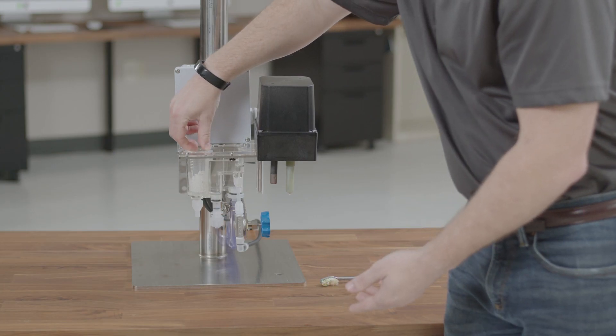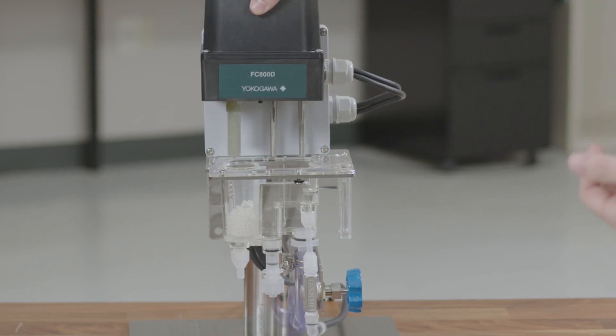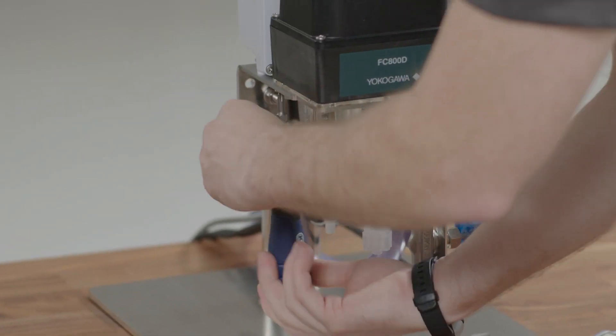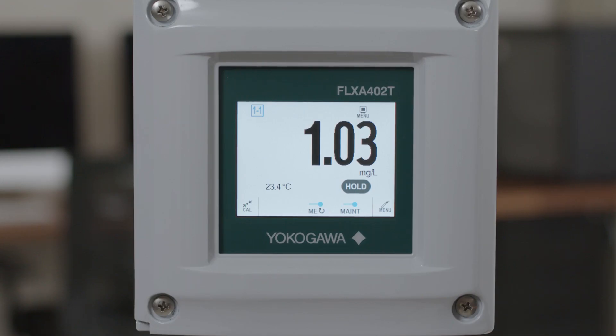Once you have replaced or cleaned your beads and cleaned your flow cell, you can move the measurement electrode assembly back to the measurement position, tighten down the two screws on the bottom, make sure that the motor is turning, and put the analyzer back into measurement mode.